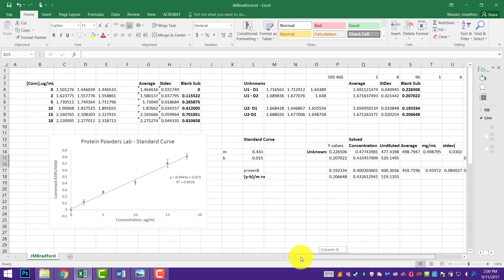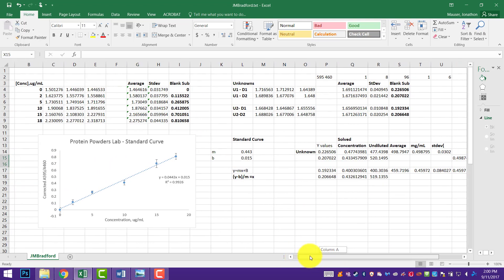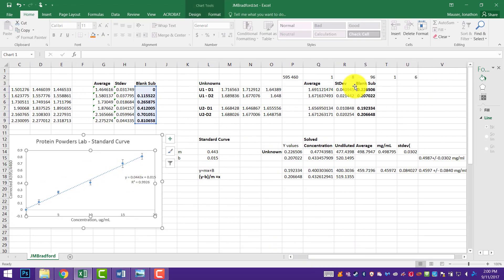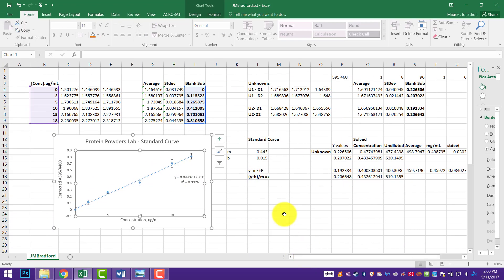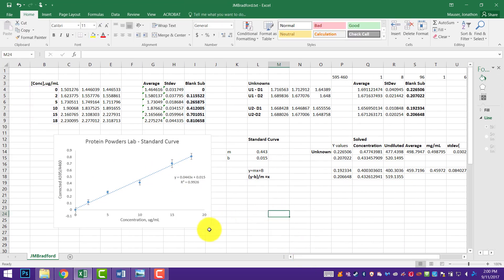So that's how you plot out the Bradford standard curve and how you solve for concentrations. This is something you'll be doing nearly every week in this lab, so I hope that helps.